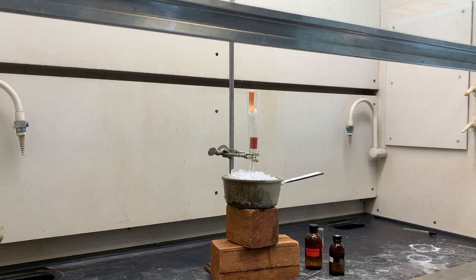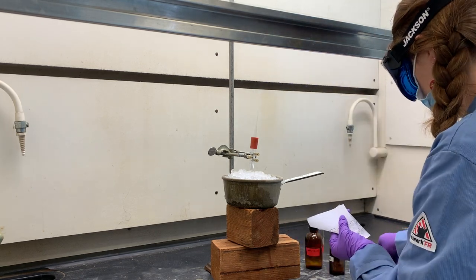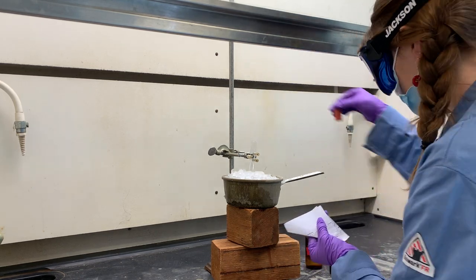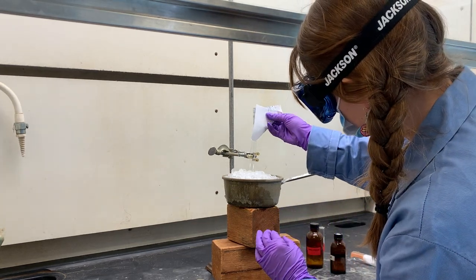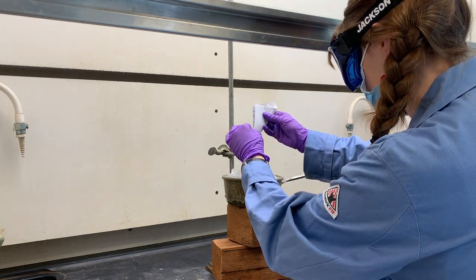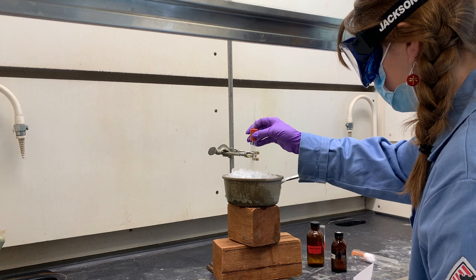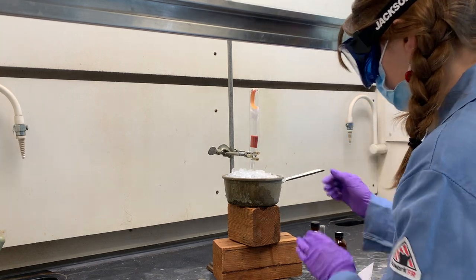When everything else is ready to go, quickly weigh out the iron(III) chloride and add it to the reaction tube. Seal the system with the thermometer adapter and place the large test tube on top. The reaction will begin to bubble vigorously after a short induction period as HCl gas is evolved. Record the times for induction and reaction.